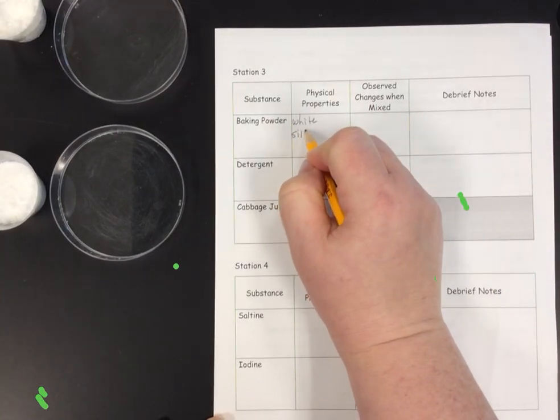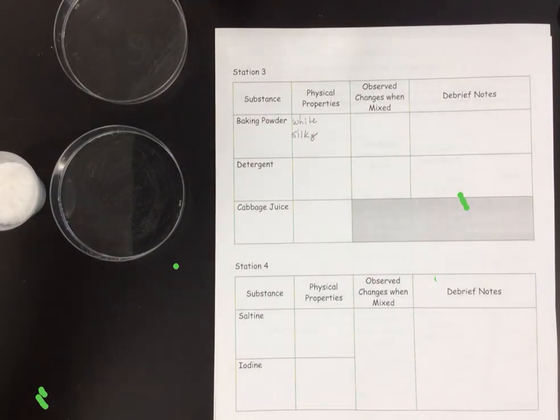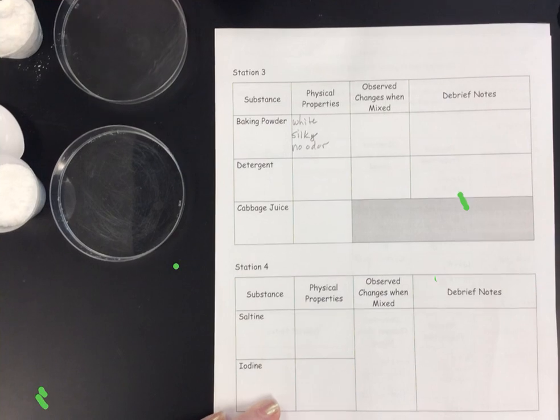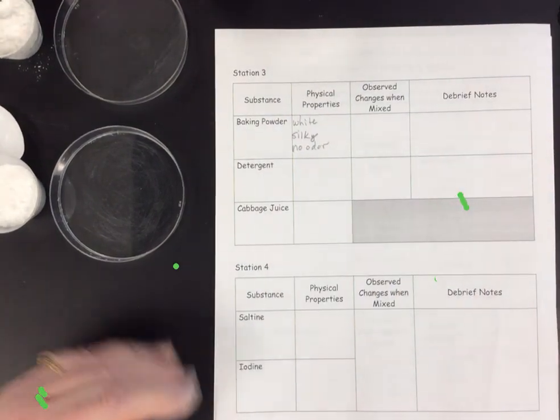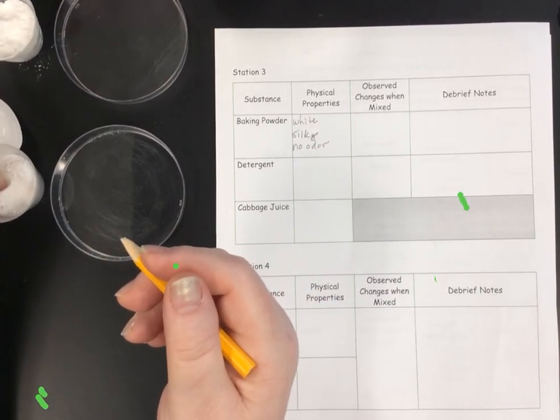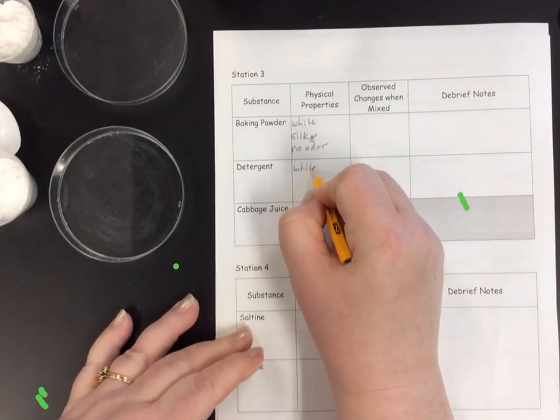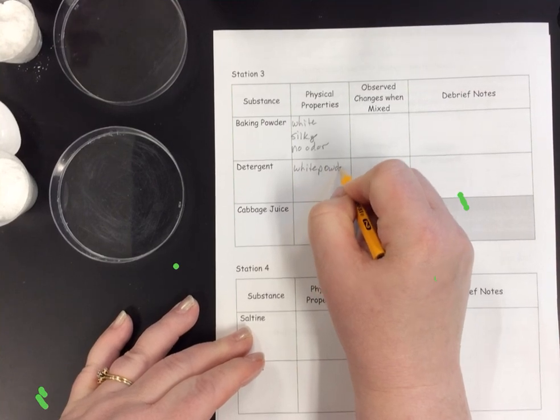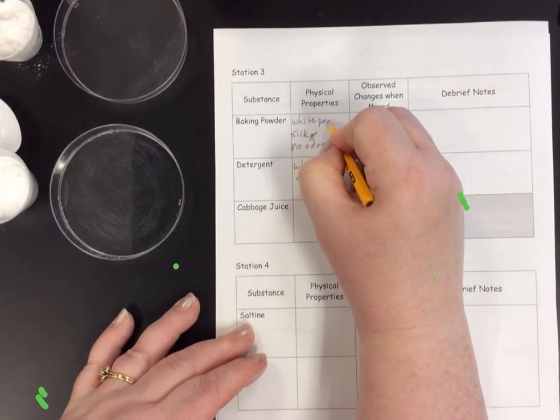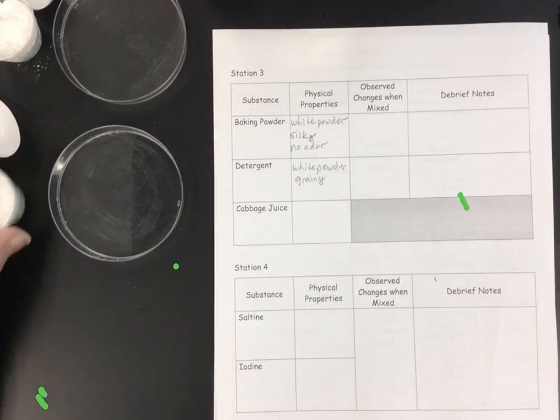The baking powder is very silky, with no odor. The detergent is kind of crumbly, it feels coarse, rough, grainy. Grainy would be a good one. Those are the descriptions of those two.